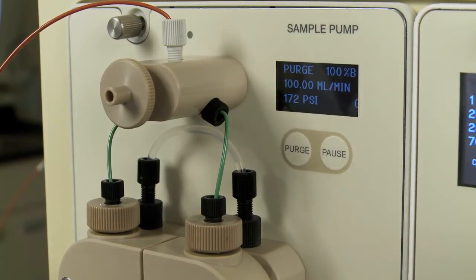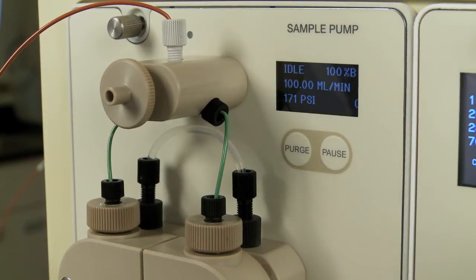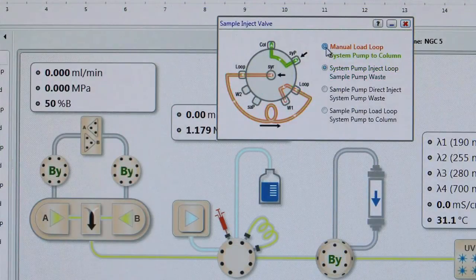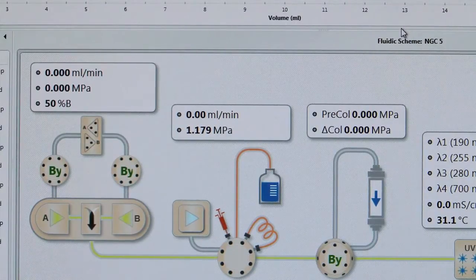To stop the purge, press the faceplate button. Select Manual Load Loop on the Inject Valve faceplate and close the faceplates. The sample pump is now purged and ready for manual control.